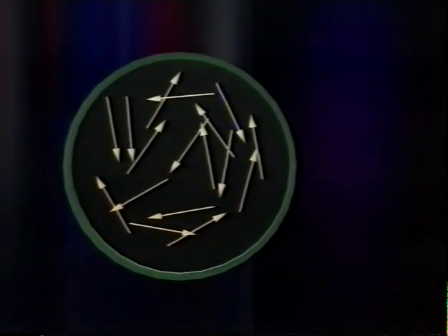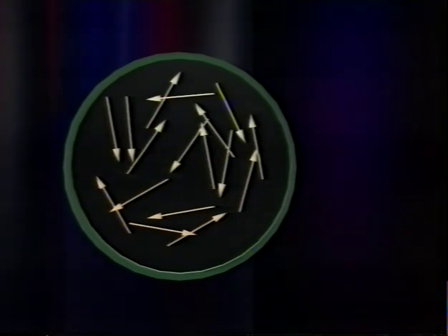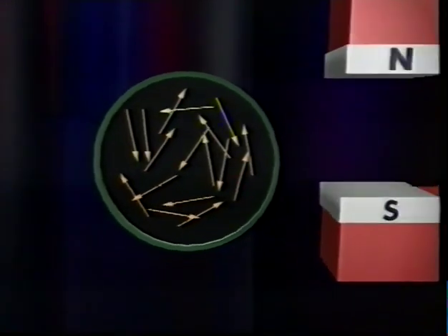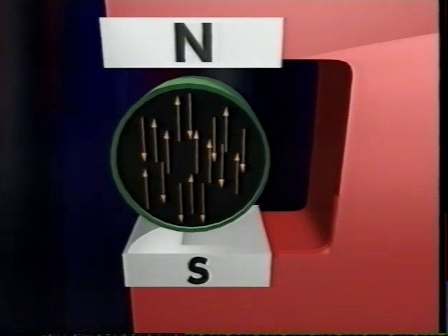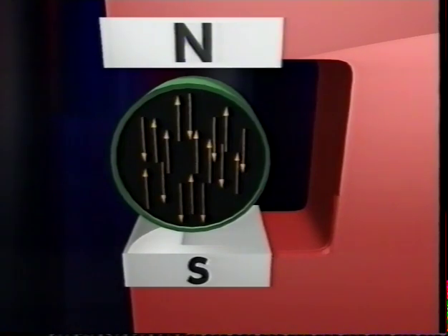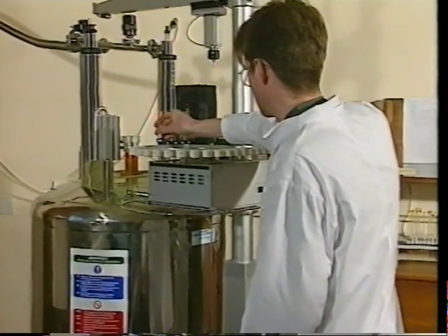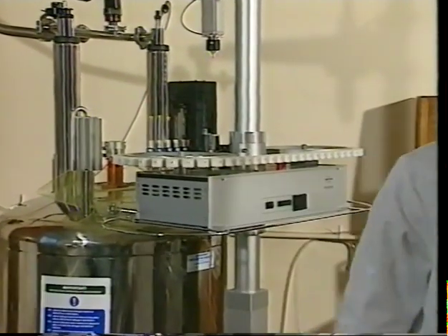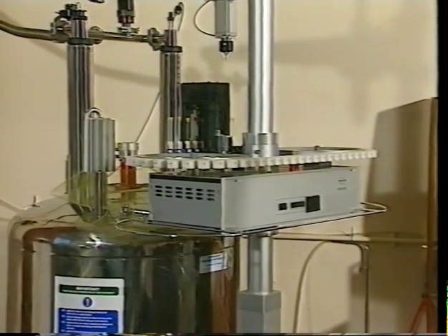In a sample, proton spins would normally be a random collection of both spin-up and spin-down states. If we put our sample into a powerful magnetic field, protons in the spin-up state align with the field, whereas protons in the spin-down state oppose it. The applied intense magnetic field used in NMR spectroscopy is created by a superconducting magnet, cooled to around 4 Kelvin using liquid helium.